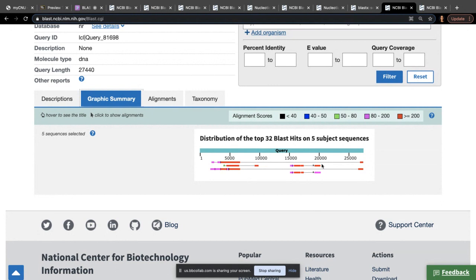This thin line here is the part where they don't match. But, so that is, okay, that's chunk of Arabidopsis, which is that too. But, so that part doesn't match anything in here, but then there's this piece of DNA that matches that middle.